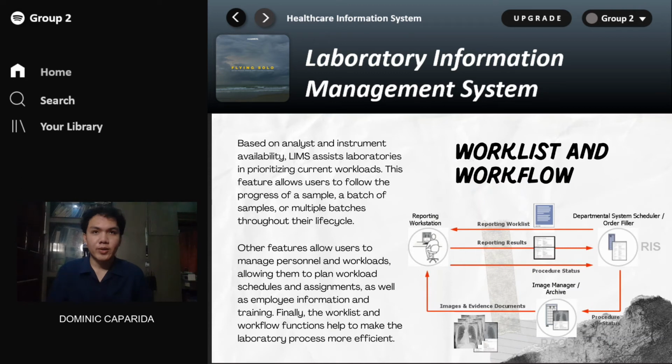Work list and workflow. This work list and workflow depends on the analyst in the institution's information system and the availability of instruments in the hospital's laboratory. This LIMS assists laboratories in prioritizing current workloads. In this work list and workflow, it focuses on the staff's or the personnel's current workloads. So they will organize everything in this process. It involves a lot of systematic processes.